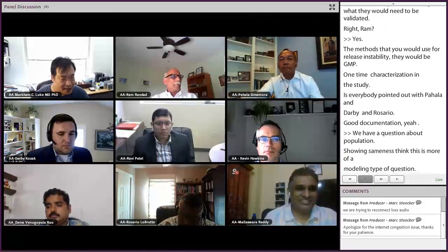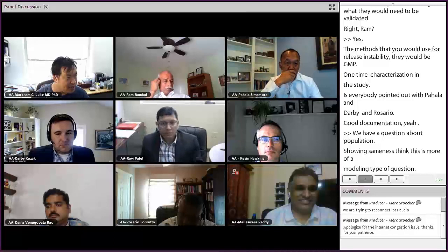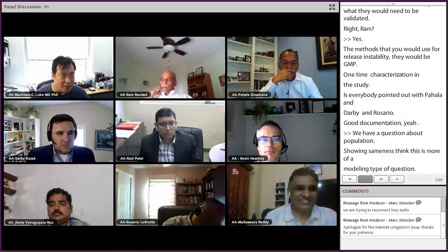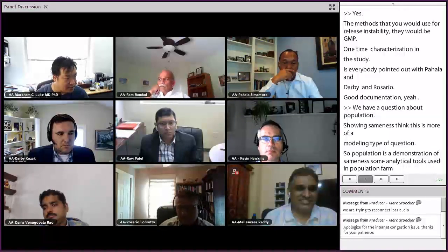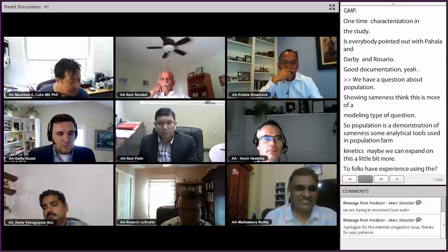Maybe we can expand on this question a little bit more. And so things like blood spot chemistry and things like that. Do folks have experience using that, and what kind of hurdles do we encounter regarding analytical methods using those kinds of techniques? Does anyone want to chime in there?